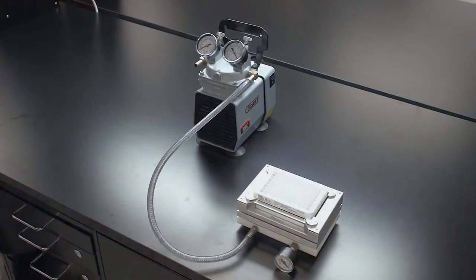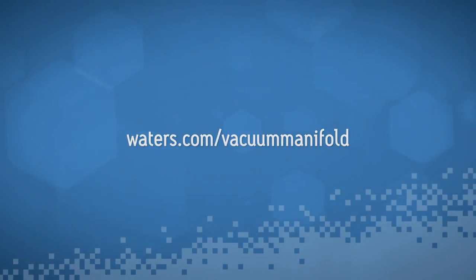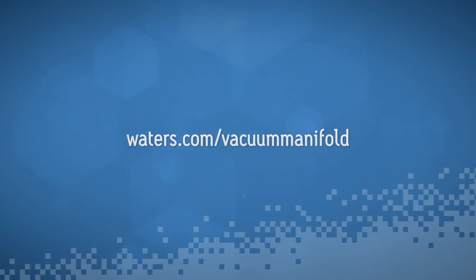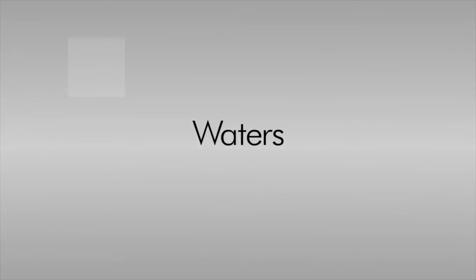For more information on the 96-well extraction plate vacuum manifold or to order, visit waters.com slash vacuum manifold. Waters, the science of what's possible.